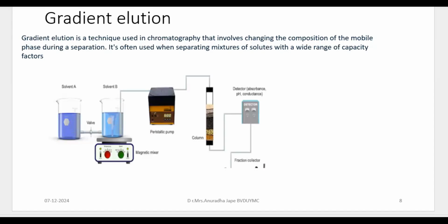Of course, the flow rate is going to be affected by column packing. Unevenly packed columns will lead to distortion of the flow, the flow rate will be affected, and ultimately it will affect the resolution. Good separation cannot be obtained. A densely packed column, so that there is no airspace and no gap, is good. A uniform and densely packed column is good for uniform flow.